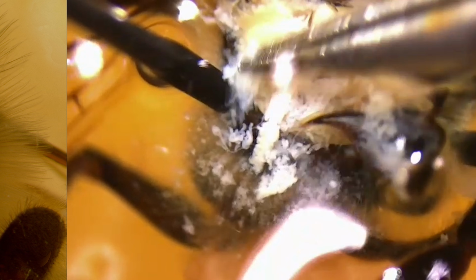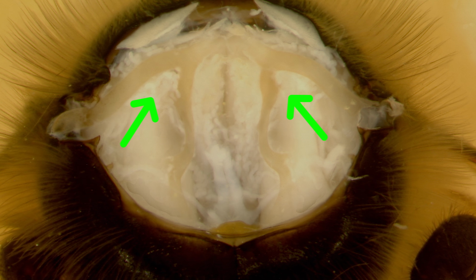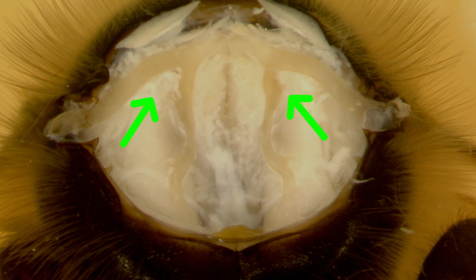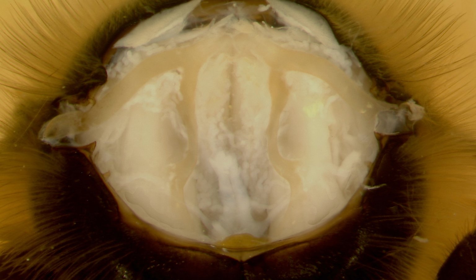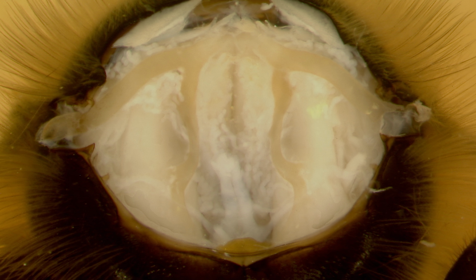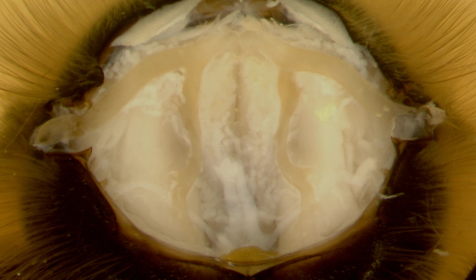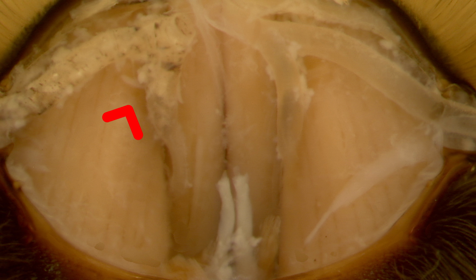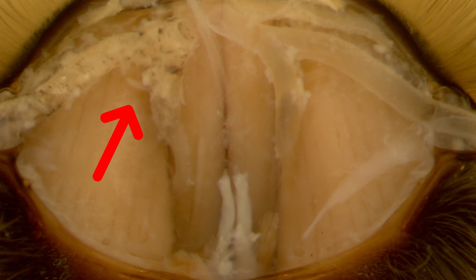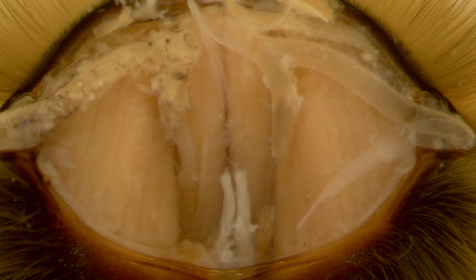Once you've done that, you have exposed those two upside down V-shaped tracheal tubes that are on either side of the bee. Now what? Well, it's really simple at this point. You've done all the hard work. Now you're simply looking for evidence of tracheal mites. What is that evidence? Well, when the tracheal tubes are infested with tracheal mites, you will see white globular or circular shaped structures in there. That's the mites or the young mites or the eggs that the mites lay.